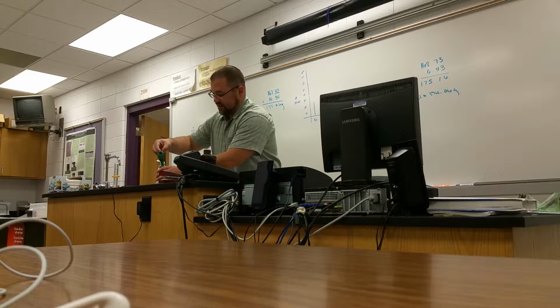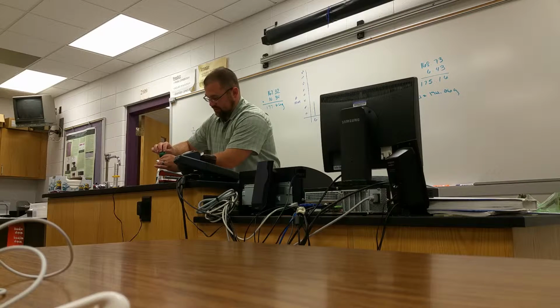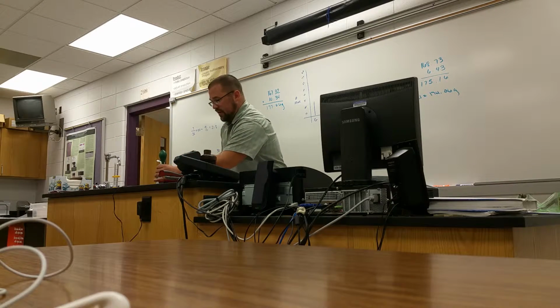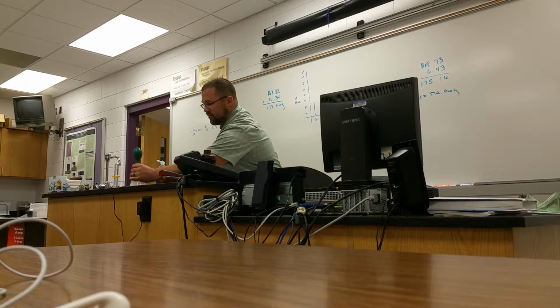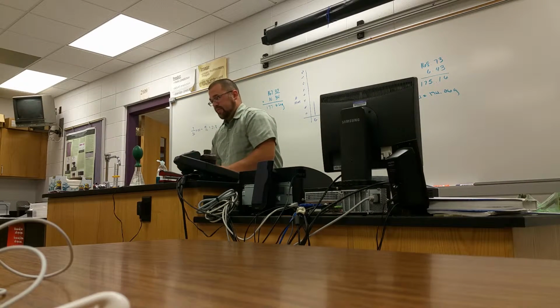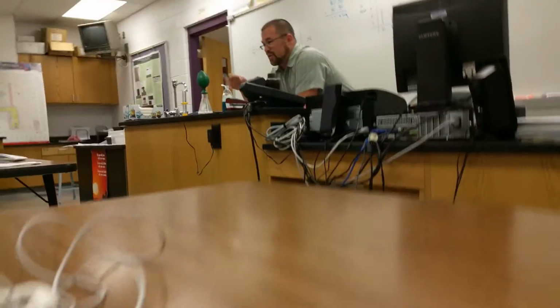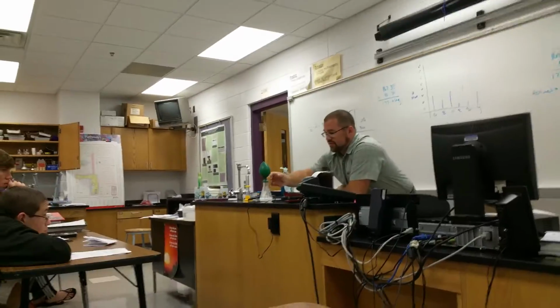So now that those are in there, see if we can get these to come back out. All right, and so now you can go ahead and observe the reaction. What you should expect is that the balloon will start to blow up. The balloon's blowing up because we're showing that in our last experiment there was a gas escaping. Hopefully this doesn't just pop off.